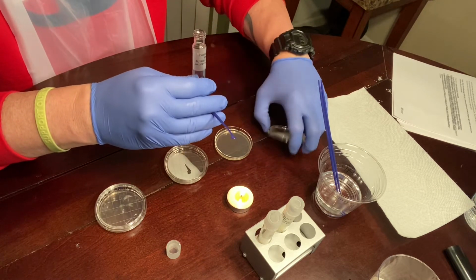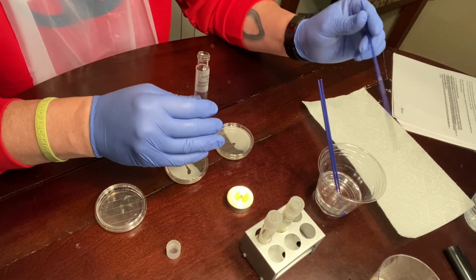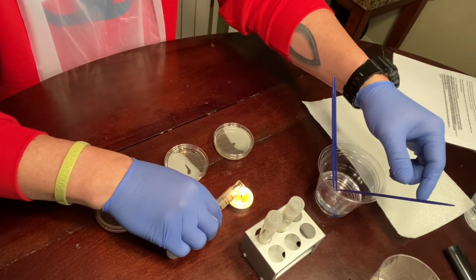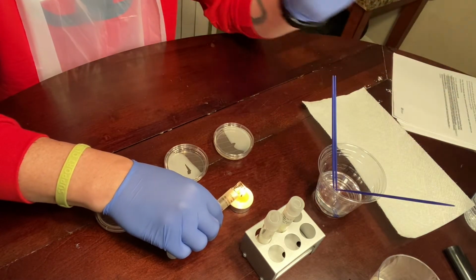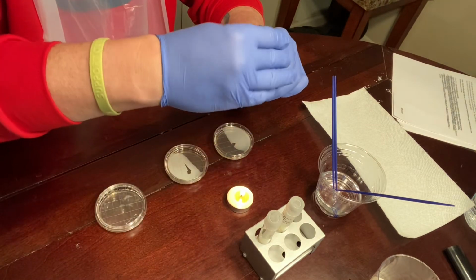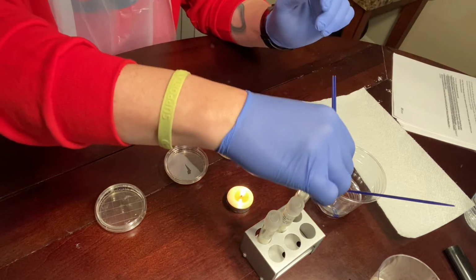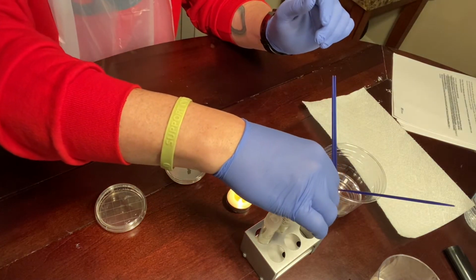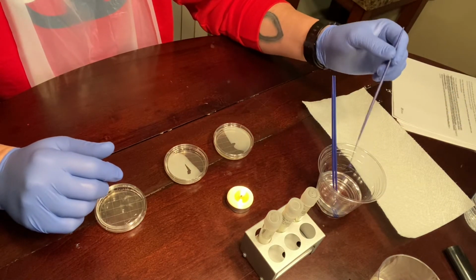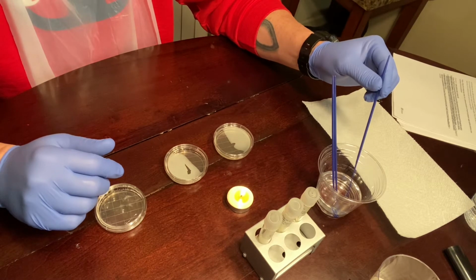I'm going to cover this dish up. Put this back in the alcohol. Sterilize my tube again. Replace the lid. For 20 seconds.